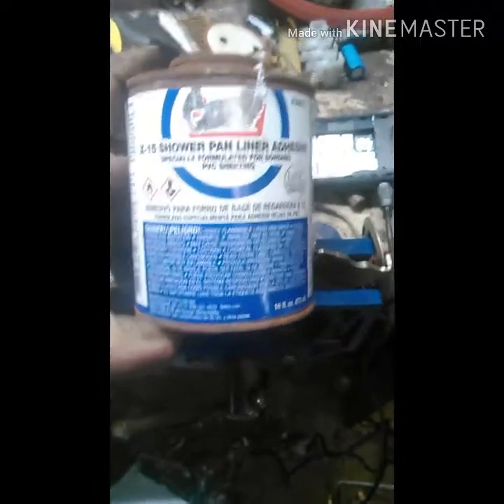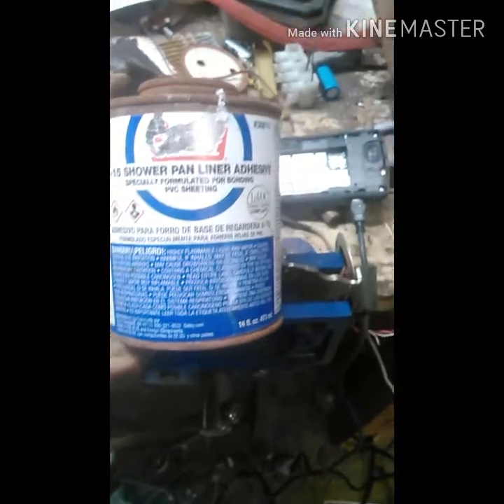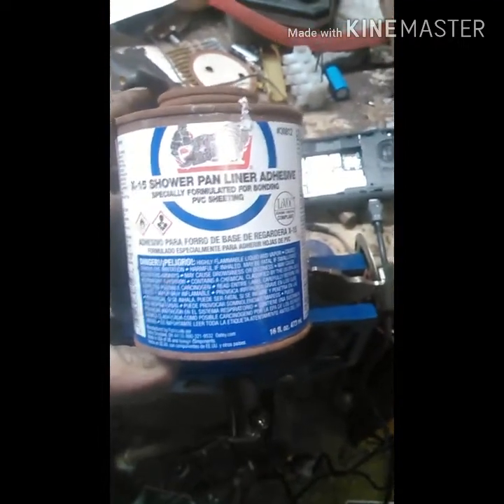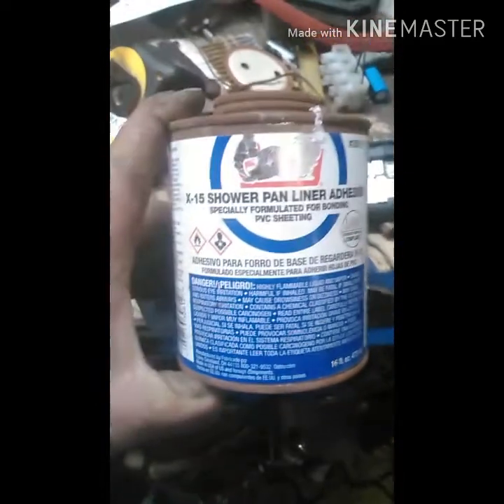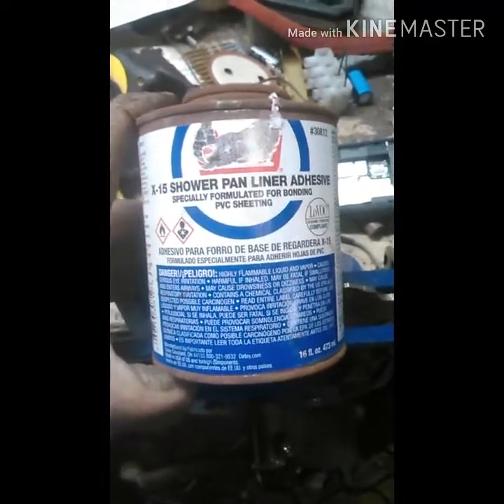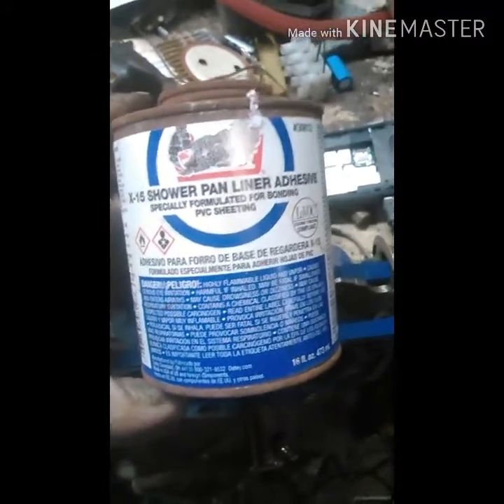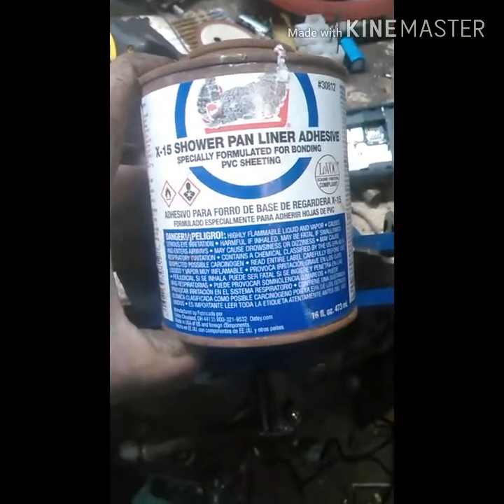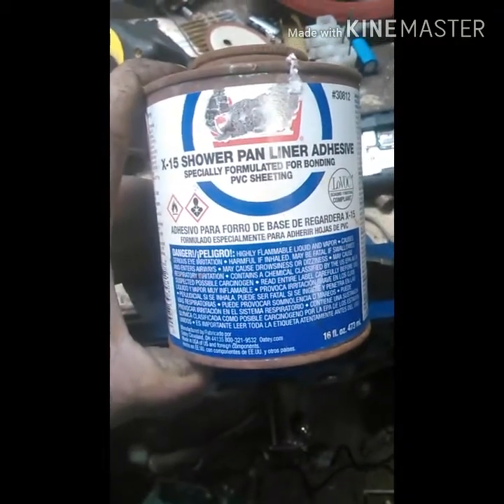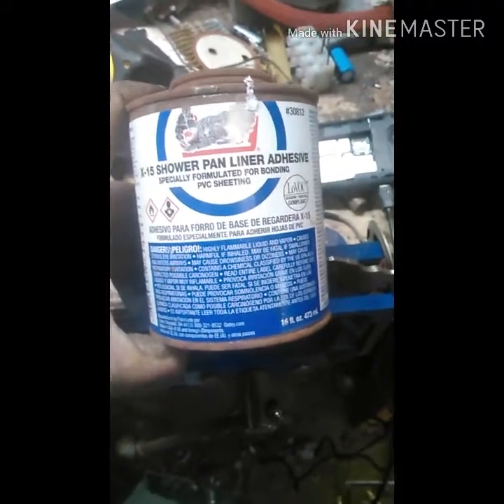Hello YouTubers and YouTubettes. Today I'm going to be separating tetrahydrofuran and acetone. The maker of this product's name would rhyme with 'goatee' — I bought this from Home Depot and the main ingredient is tetrahydrofuran and the second is acetone.